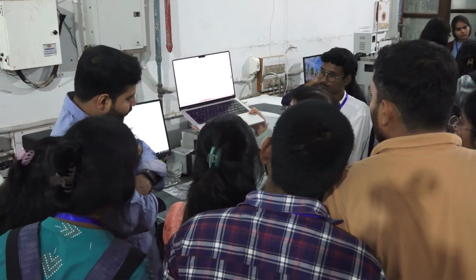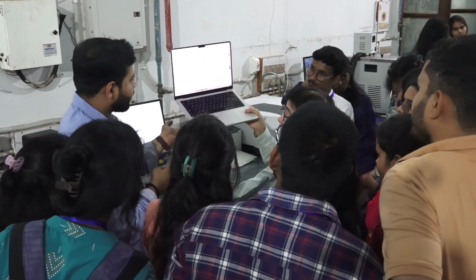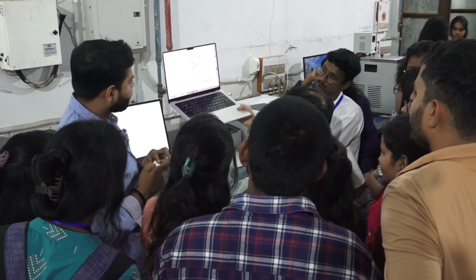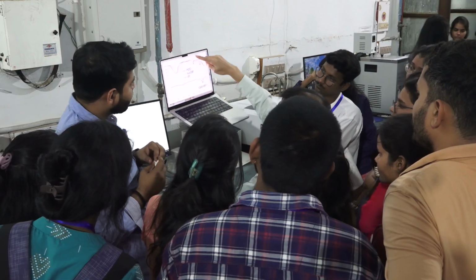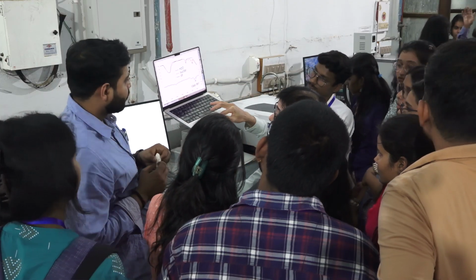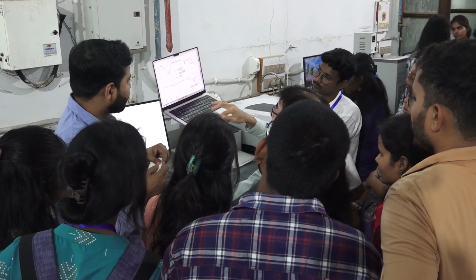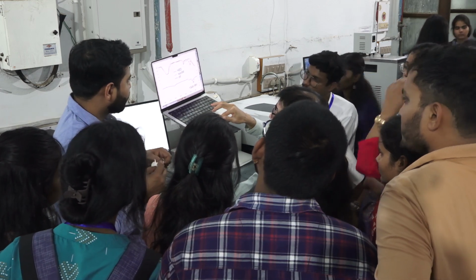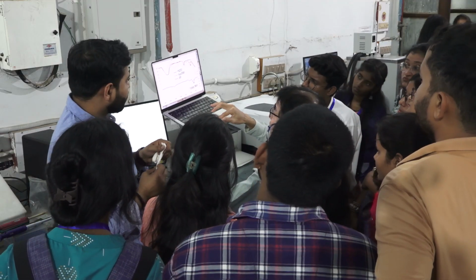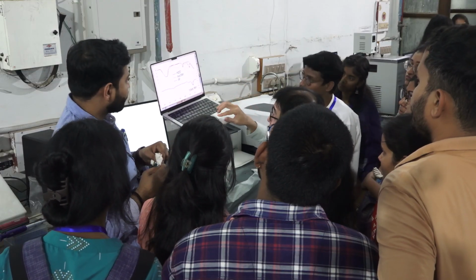Okay, do you see? Black is the H2O solvent spectrum. Red is the solution spectrum, 5 molar sucrose. So you see there is a clear difference. This part corresponds to CH stretching. And this part corresponds to CO stretching or some torsional motion, rocking motion, or wagging motion.